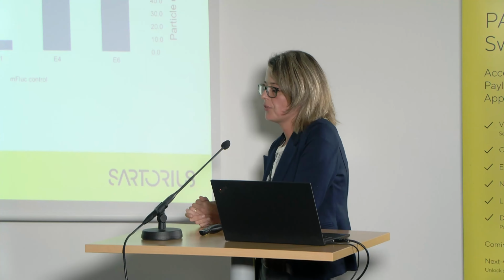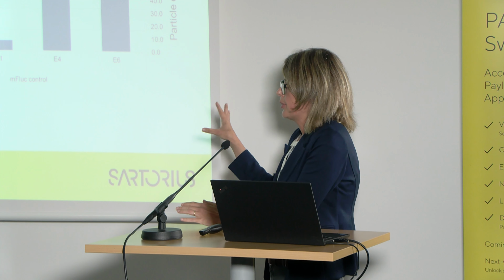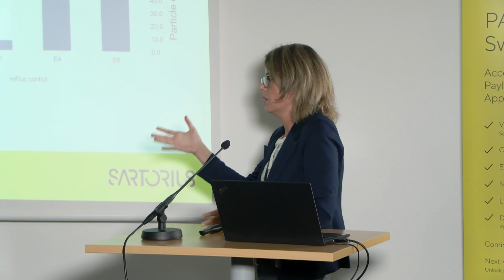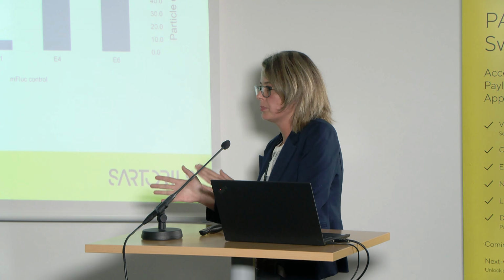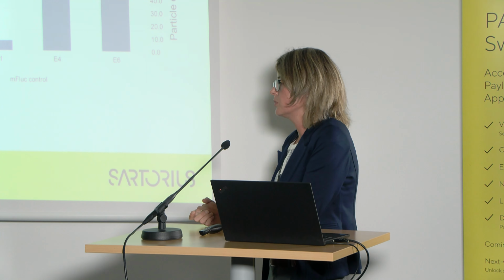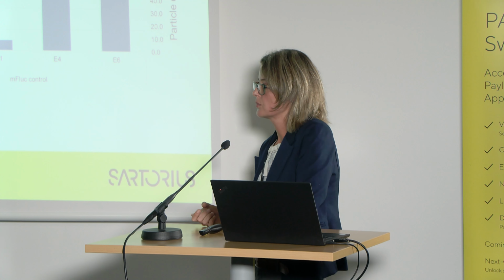We just checked for toxicity, for example, and there we didn't see a difference. We could transfect a higher volume, so more particles, but we didn't see a toxic effect on the cells. It's not really answering your question, but partially maybe. It could be a good continuation. We have to study this more in detail. It's a good sign that it wasn't toxic. Thank you.